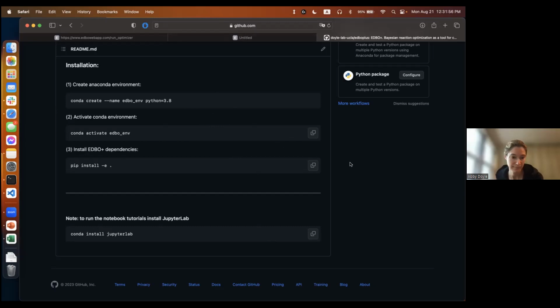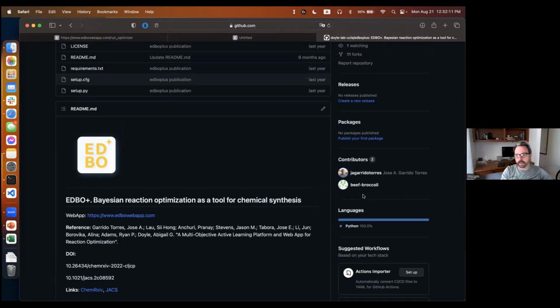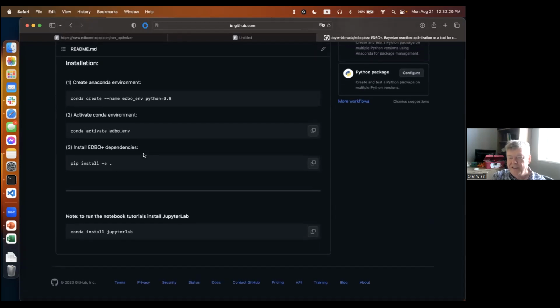They love it, by the way. It's quite amazing how quick the uptake of this workflow has been. From Abby's first pub to the second, it's popping up everywhere when I'm consulting and such. Awesome. For those of you who were at the NOS, the presentation from Jason on when they got the OPRD award was basically a love letter to EDBO Plus. I mean, from the 45-minute presentation, a good 15 minutes were this.